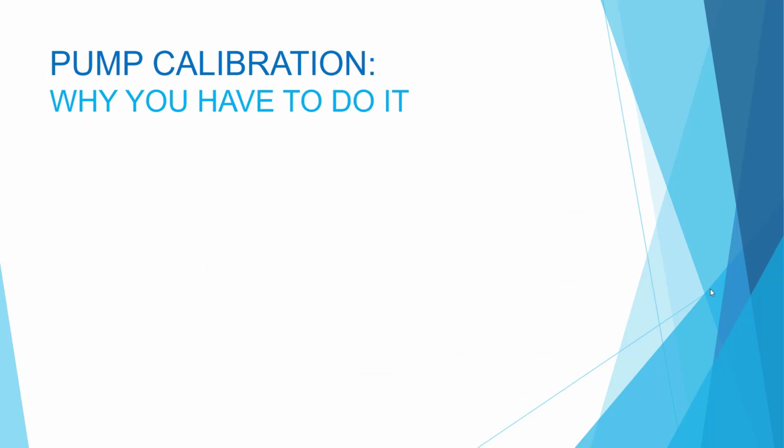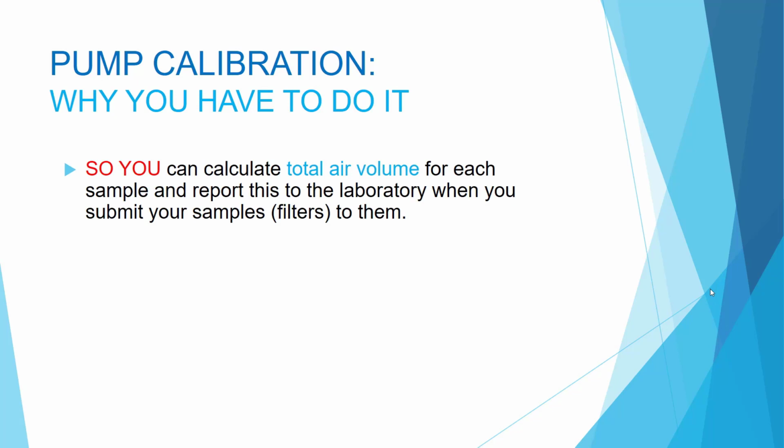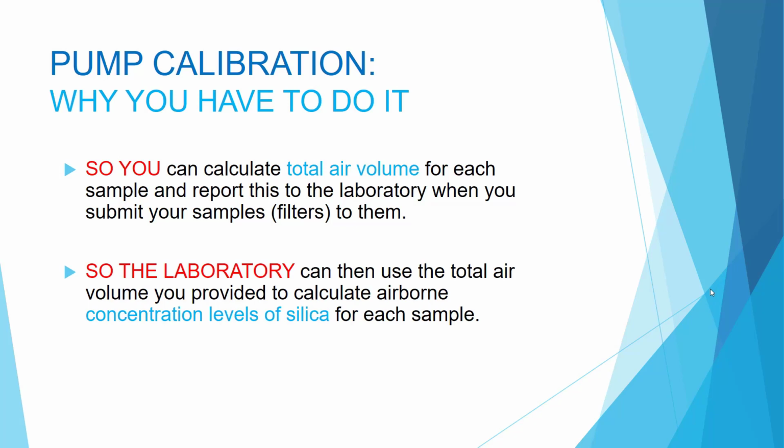Some new users may question why they have to calibrate the pump every time they collect a sample. Here's why. With every silica sample that you submit to the lab, you have to advise them of the total air volume that was pulled through the filter. The laboratory will measure the silica dust on the filter and will use the total air volume that you provide to calculate the concentrations of silica in air.